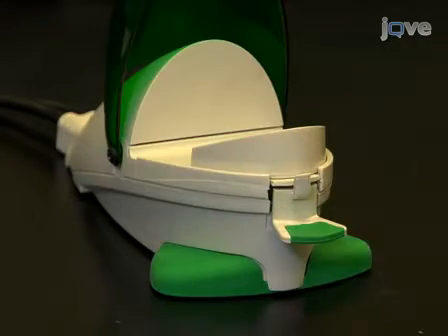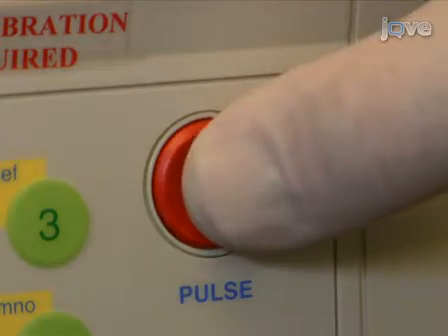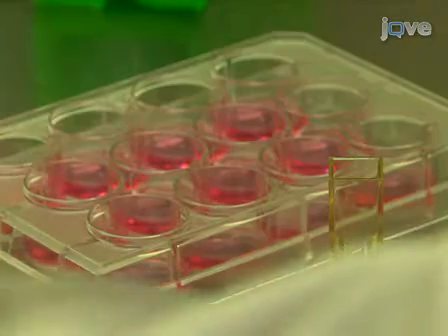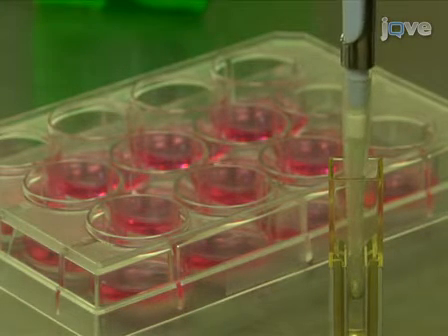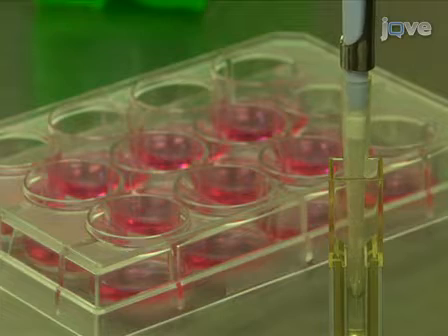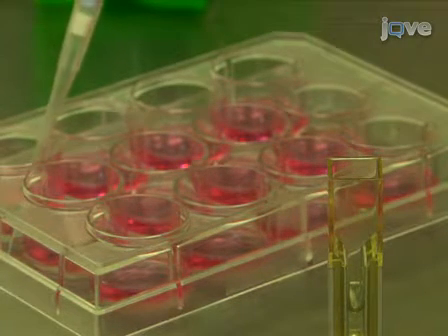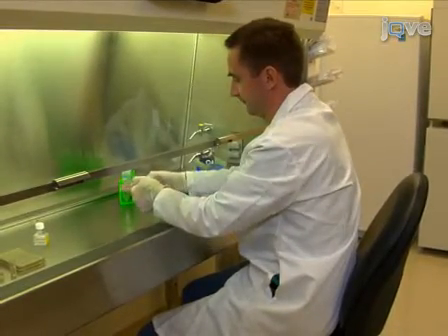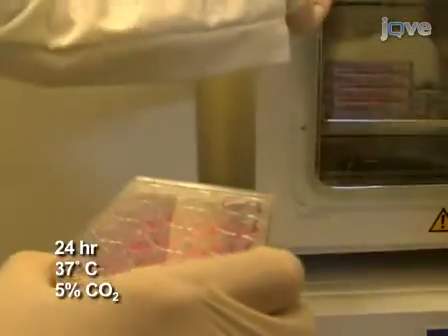Next, place the cuvette into the shock pod chamber. Press Pulse to deliver the electric shock to the cells. After electroporation, proceed as in the plate method: mix the cells, then transfer aliquots to cell culture plates filled with pre-warmed media, and set up control wells that were not electroporated. Swirl the plate and tap, then leave the cells to recover for 24 hours at 37 degrees Celsius and 5% carbon dioxide before analyzing transfection efficiency.